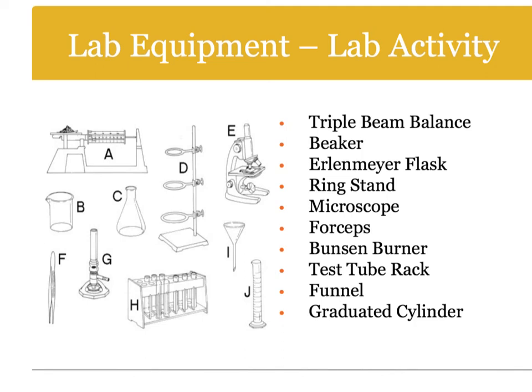As you can see, I want to start talking about lab equipment. We've talked about designing controlled experiments. We've talked about analyzing data and constructing graphs. So let's take a moment and look at some lab equipment that you're going to use throughout the year. You have a sheet that has these items pictured on it, and you will be asked to fill out what they are used for and also to identify them as well. So let's go through that real quick.